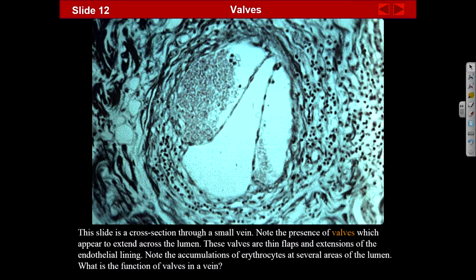They're probably lymphocytes. Blood still has leukocytes in it, right? And actually these look like they're outside of the vessel. These look like they're in the connective tissue space for whatever reason. Like here, see here? But it would be all this and none of this.